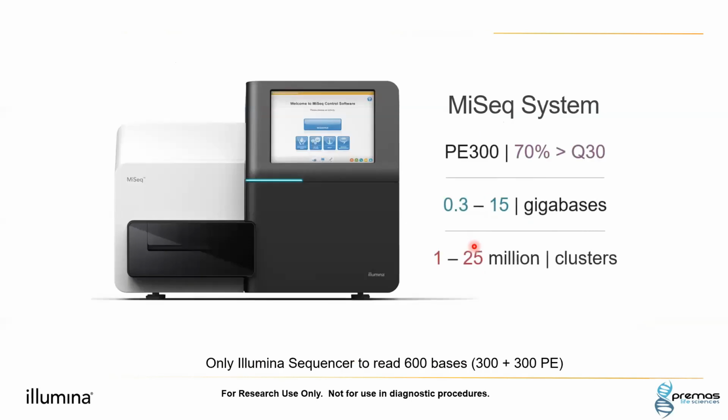Now coming on to our MiSeq. This machine has certain highlights. It actually offers you paired-end 300. This is the highest read length offered in the entire Illumina range. So PE300 is offered by MiSeq. The data is 15 GB and 25 million reads, and other specs are mostly similar to your MiniSeq. This is the major highlight offered by MiSeq, PE300.